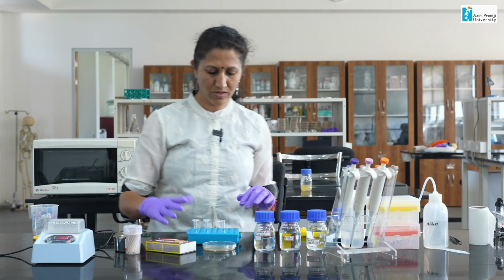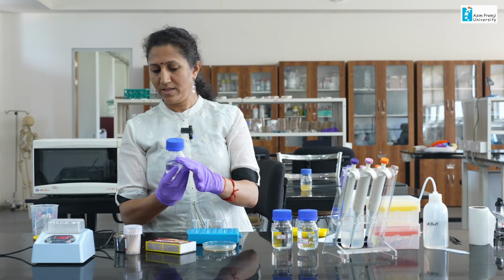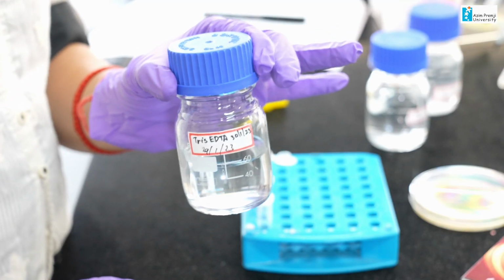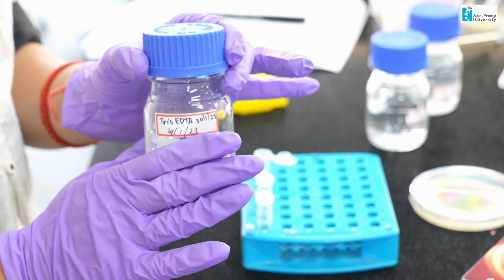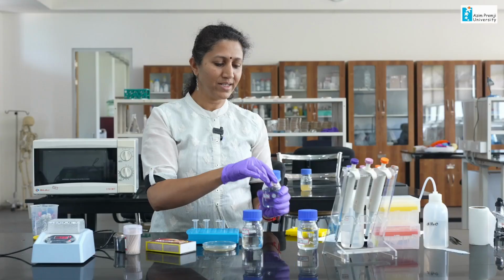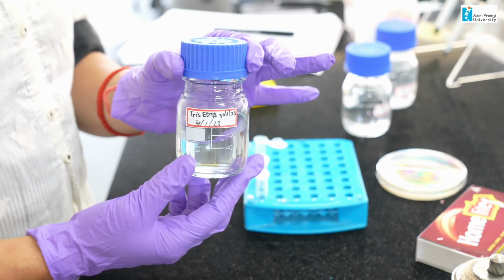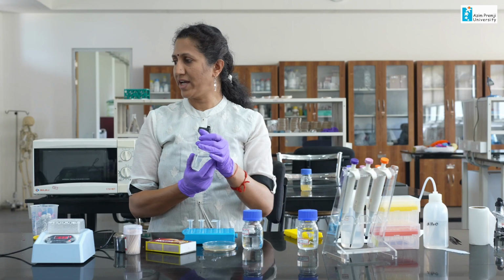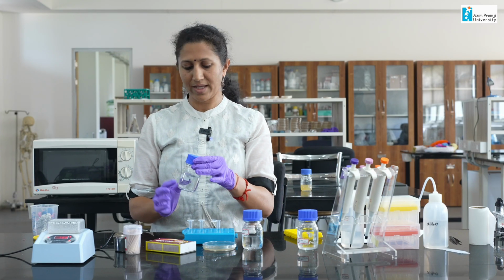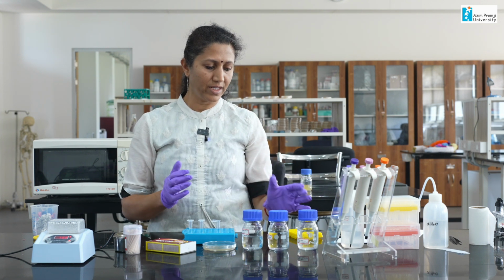To do that, I have the required reagents here. The first reagent is Tris-EDTA. This helps to protect the DNA from enzyme degradation. The second solution is KOH-EDTA. This is the protocol that I am going to follow today, a simple protocol which was developed by Zebin et al. in 2014. This solution breaks down the cell membrane and releases the DNA.